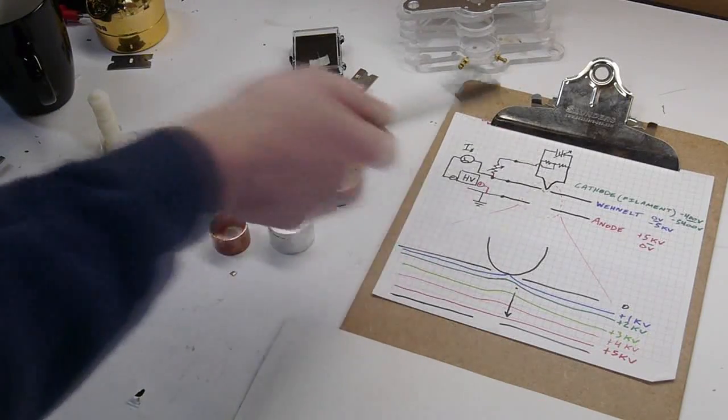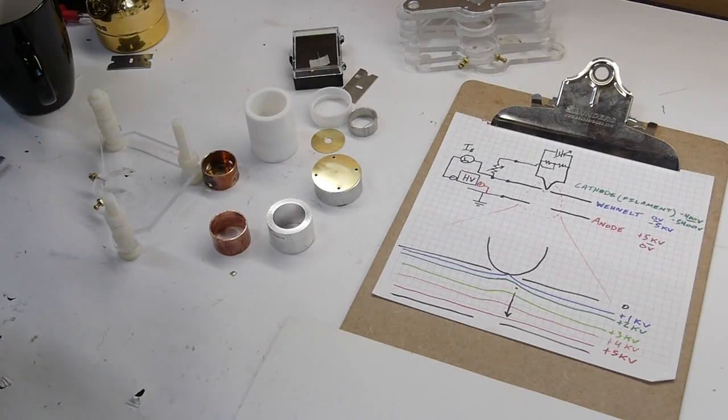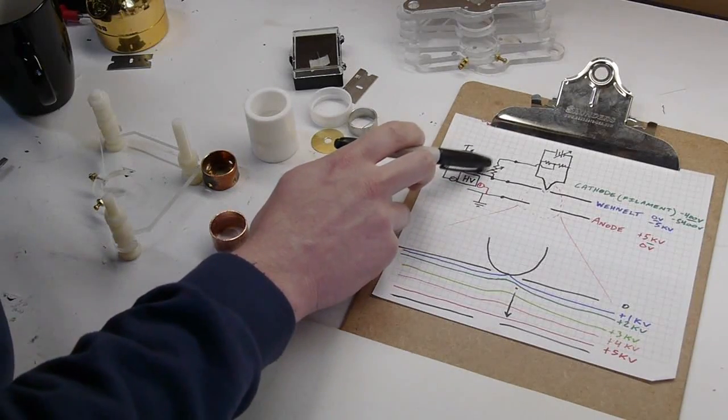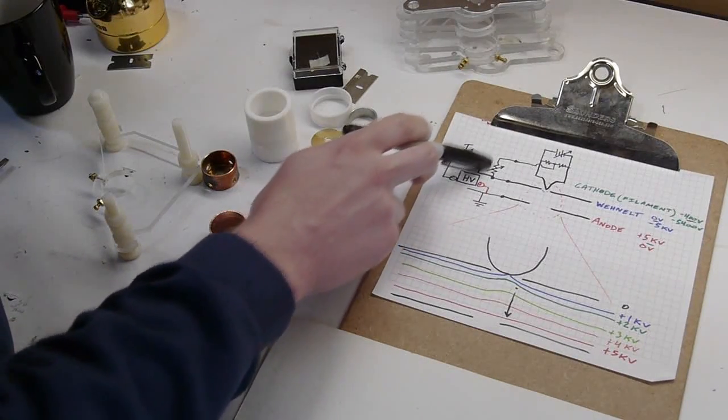The combination of the Wenelt and the voltage on the cathode controls how many electrons are produced by this gun, and the setting is actually this variable resistor here, known as a bias resistor.